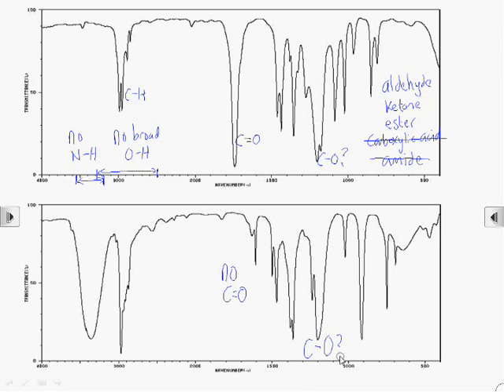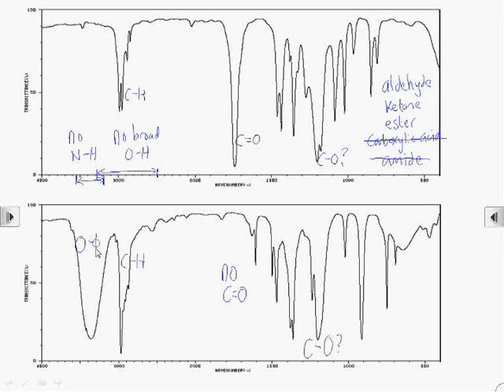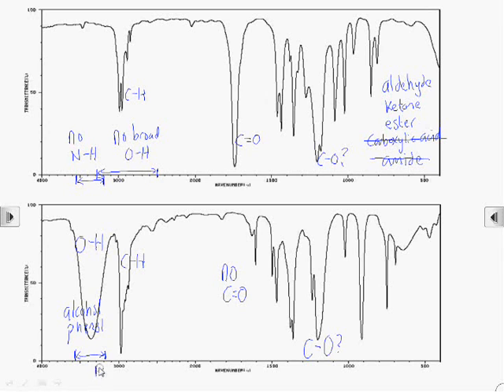But there may well be a carbon-to-oxygen single bond absorbing at about 1200 wavenumbers. The carbon-to-hydrogen peak is pretty much ubiquitous in all organic molecules. And here we have a large OH stretching — very broad, very characteristic — in the region that the datasheet tells us we should associate with alcohols or phenols. Compare that to the spectrum above, where you've got an OH region shown for where a carboxylic acid would be. So in this case, we can be fairly sure it's not a carboxylic acid OH, but this is an alcohol or a phenol.